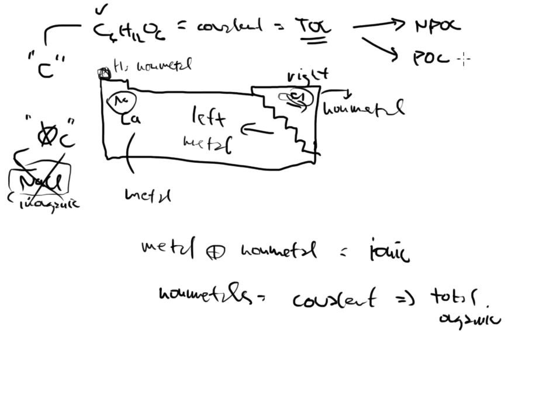So when this machine does what it needs to do to my sample, the glucose is not going to go anywhere. The glucose is going to stay there, just like it stayed on my countertop. Therefore, this is going to be classified as a non-purgeable organic compound, NPOC. And that is really what this instrument pays attention to and what this instrument measures.